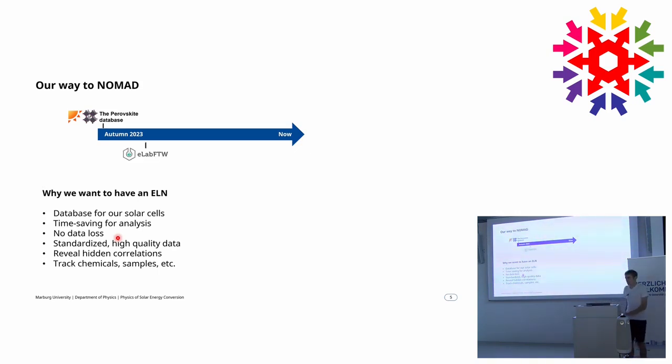The first thing we thought was, okay, let's go for eLabFTW because it had a nice graphical user interface and many people were using it. But then we, luckily, I would say, found out about NOMAD. We heard about people here at HU and HZB working with NOMAD, and the perovskite database project was migrating to NOMAD. I think many people involved in the database project are now involved in NOMAD. This is why we said, okay, don't do eLabFTW, just go directly to NOMAD.